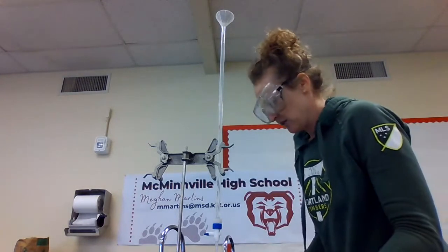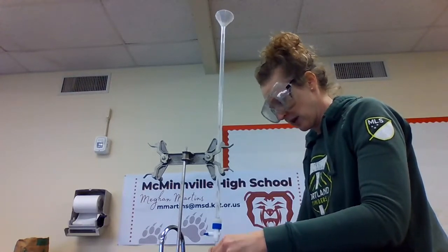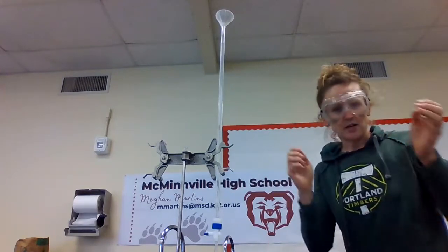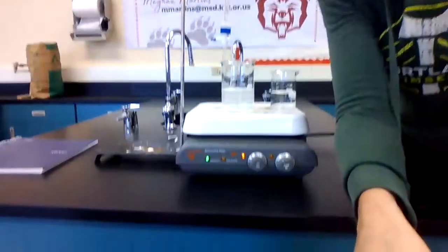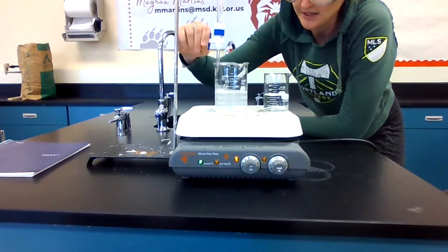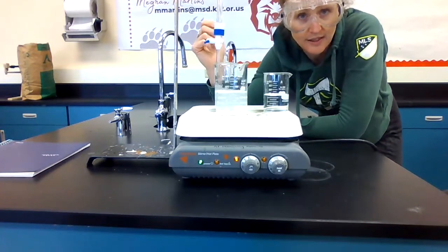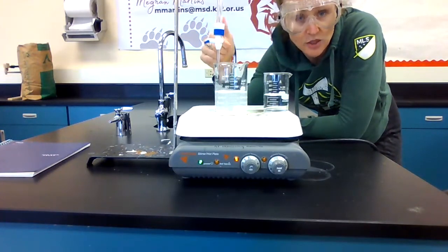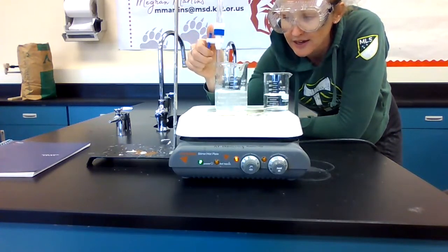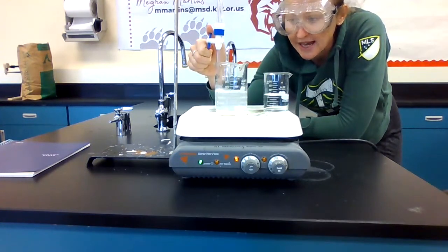Okay, we want to get this as close as we can. Keep that magnet spinning as much as we can. All right, so we're about to start this. And I'm going to show you what happens as we add base. See how pink appeared and then disappeared? So wherever you see pink, you have excess base, and then it disappears in the solution, and that means the base has reacted with acid, and what's left in our solution is acid again.